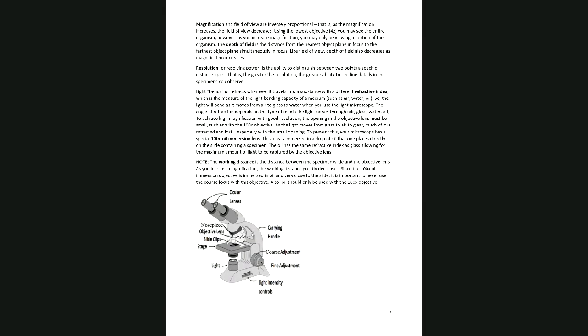Now when it comes to depth of field, this applies to organisms that are big and thick. We would have given you some prepared slides to look at, like paramecia, amoeba, blood, and some miscellaneous stained bacteria. For the paramecia and amoeba, and especially the amoeba, remember those are much larger organisms. They're eukaryotes, they're protozoans. And so on the low magnifications, you would see the entire amoeba.